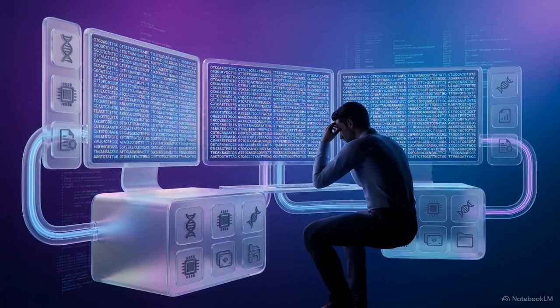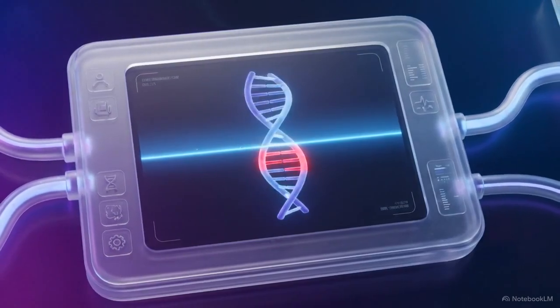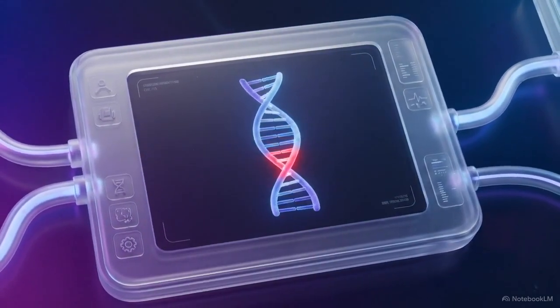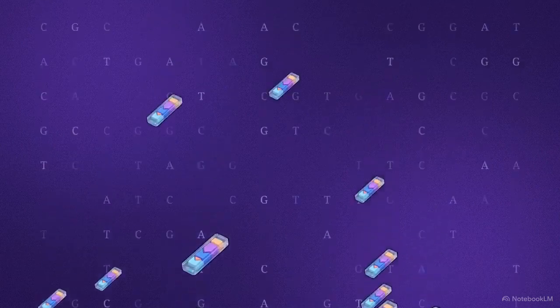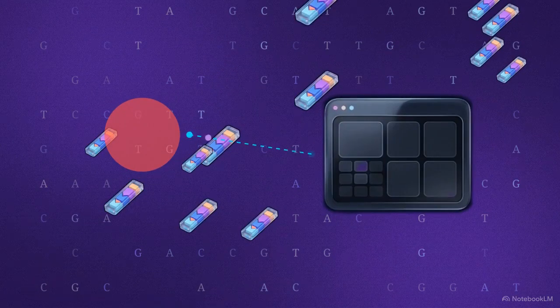Human analysts can no longer keep up with the scale of this multi-omics data. Integrating artificial intelligence and machine learning is now an absolute necessity to automate these pipelines and reduce interpretation time. The NGS journey transforms a messy data deluge into the automated identification of targeted cures.